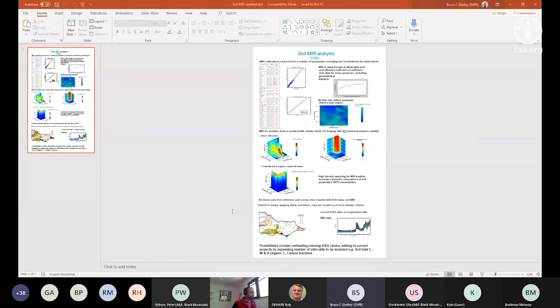Field samples, the aim was always to use the natural surface. The idea was that this could be used in field, particularly when we're doing a lot of 3D field digital soil mapping, and we were able to do real-time analysis on the core. In Victoria, unless you go out in winter, certainly up in the northern part, you pull cores out, they're pretty dry most of the year.